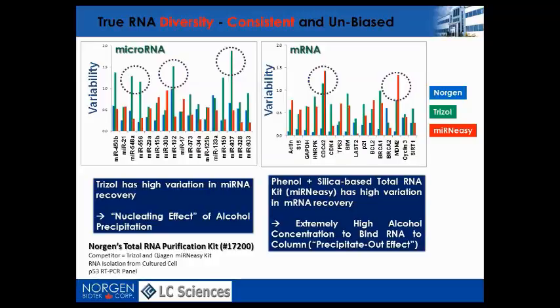So while diversity is important, it is intimately linked to consistency. For good RNA extraction, it is desirable to have both diversity and consistency. This is especially important for precious clinical samples, where you have only one shot to study. Hence, you want to isolate RNA, and there is no doubt that RNA extraction works.